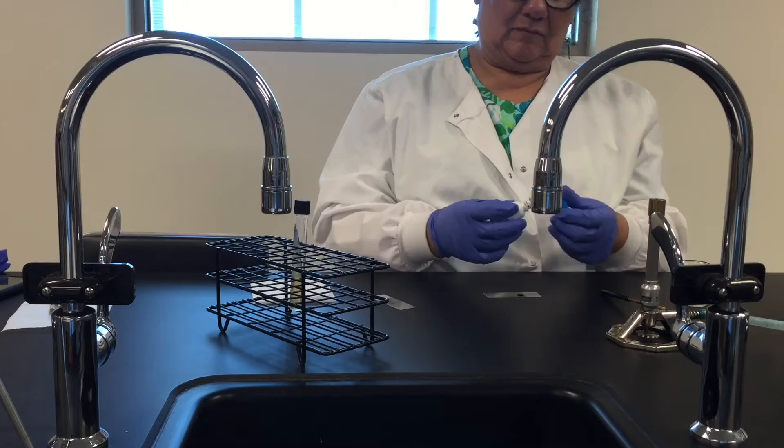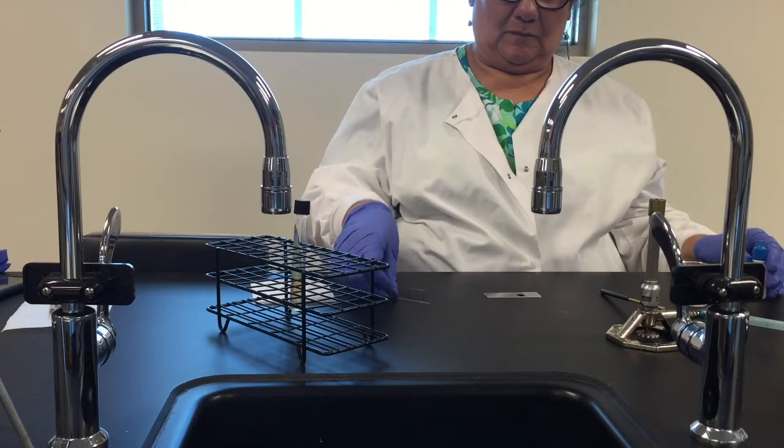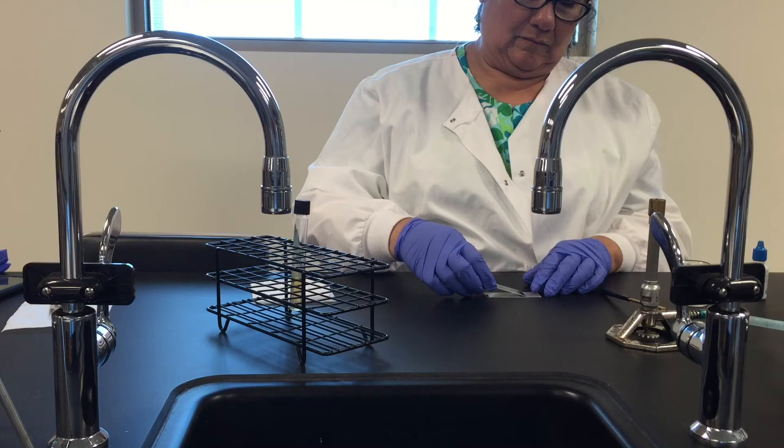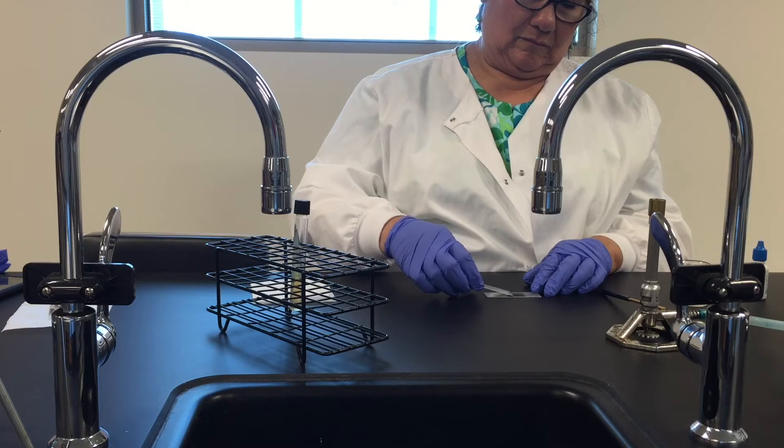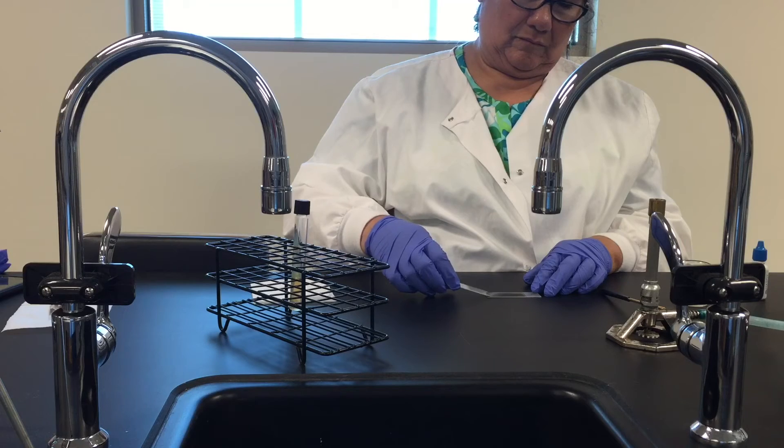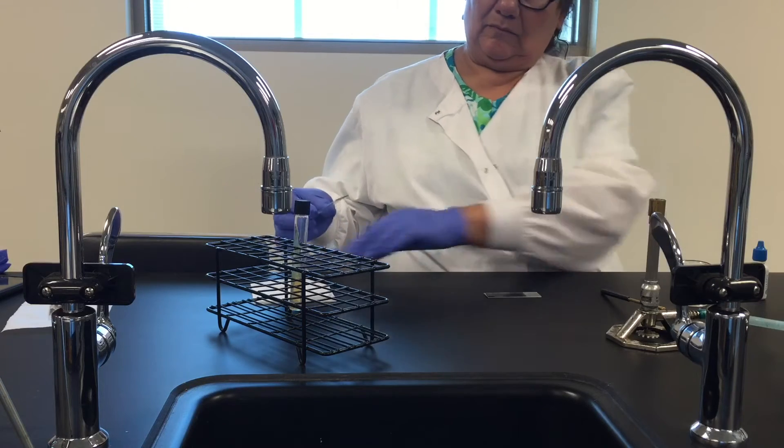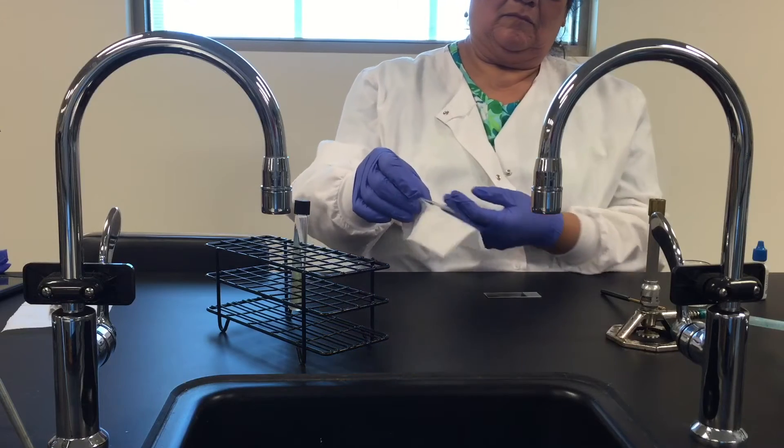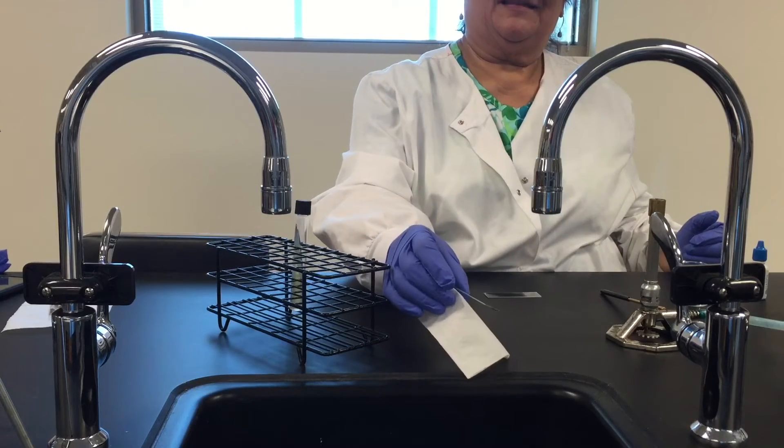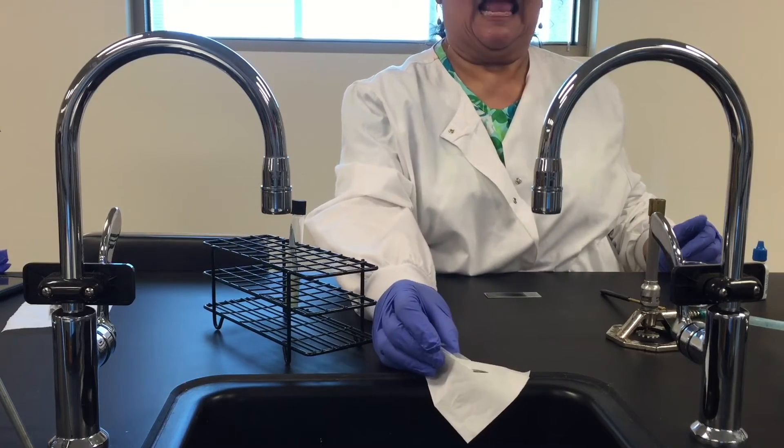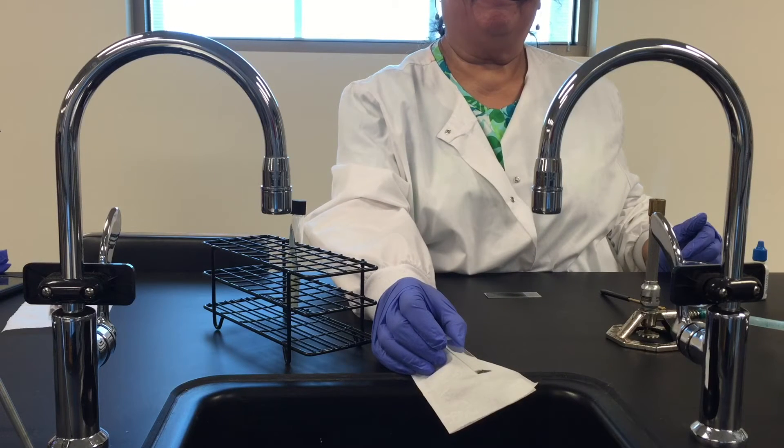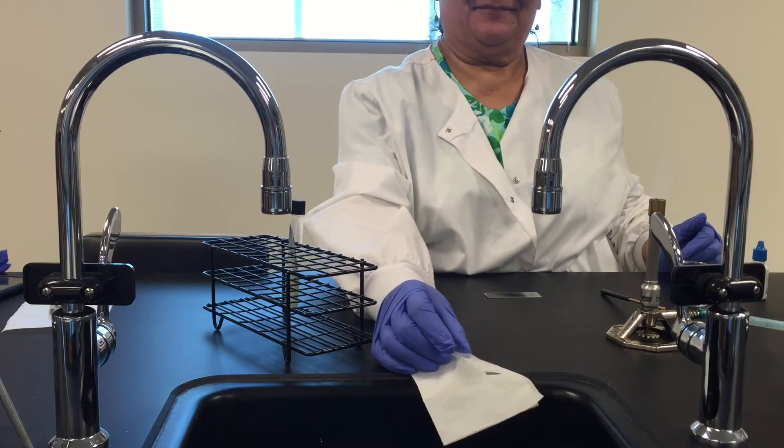Once we've done that we're going to pick up a second microscope slide and use it to drag that material across the entire surface of the slide. Now once you've done that you've got live microorganism on the end of that slide so you're going to give it a rinse with alcohol and then wash it. We don't happen to have any alcohol with us so we're just going to set it down in the sink for now.